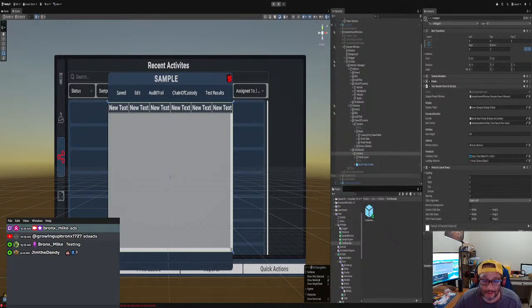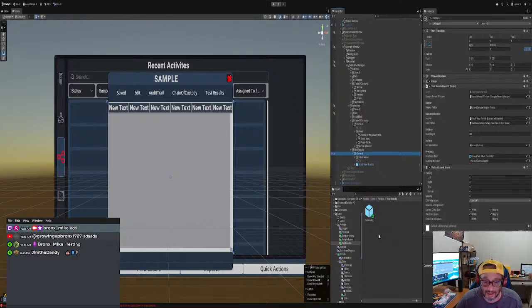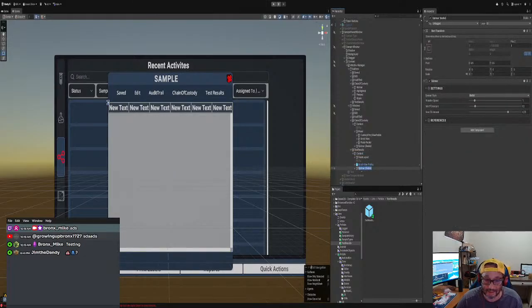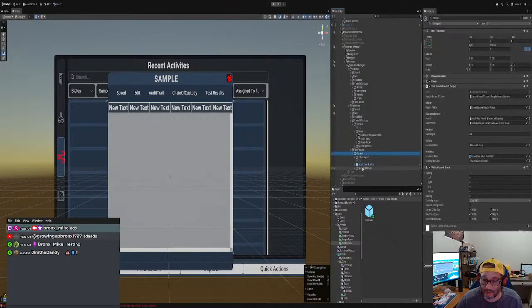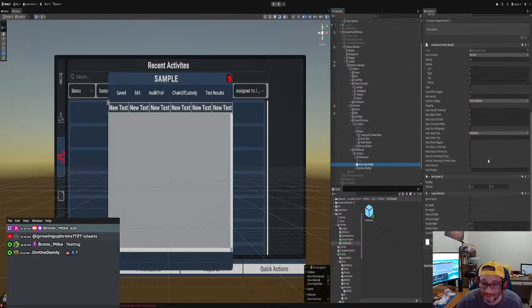All right, so let's go back. All right, so I think that should be it. Wait a minute. Should we add a loading indicator? Yeah, we add a loading indicator by doing right click UI, and remember I got the plugins, so I'm gonna use the plugins for that, and we are gonna go spinner loading indicator, right? Feedback message, that's fine. We don't need it right now. Okay, and let's just double check everything is working correctly. Yeah, that should be good.